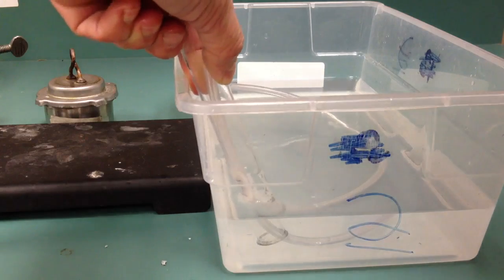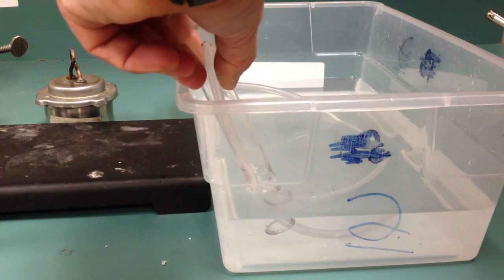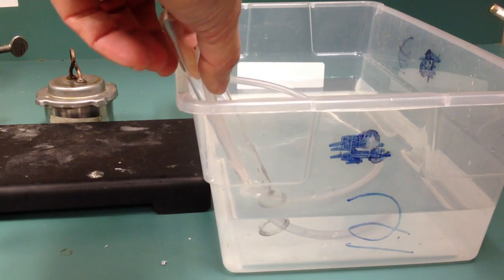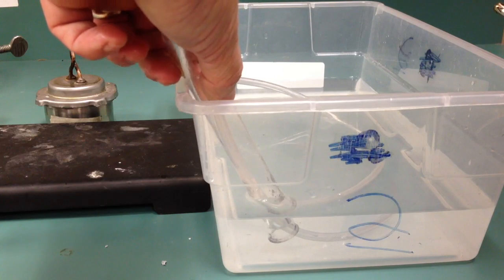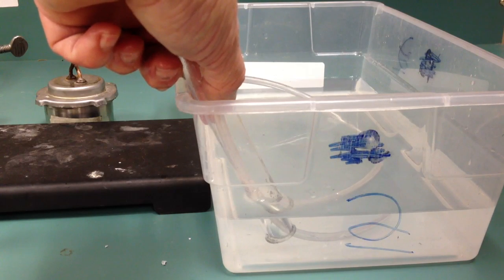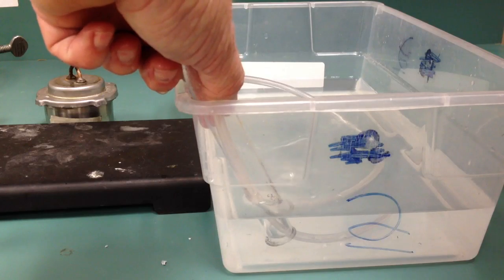Okay. I got most of the water is out. Let's give it just another minute. It will be all hydrogen gas in there. And hopefully, I can get it to react this time. So, the hydrogen is in here. See if we can get it to react with the oxygen.